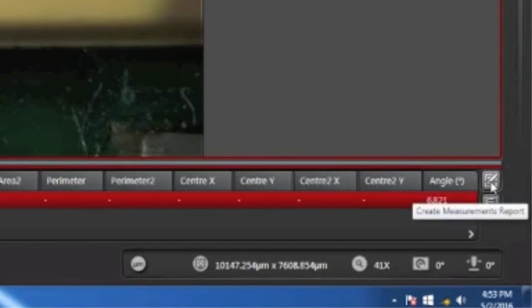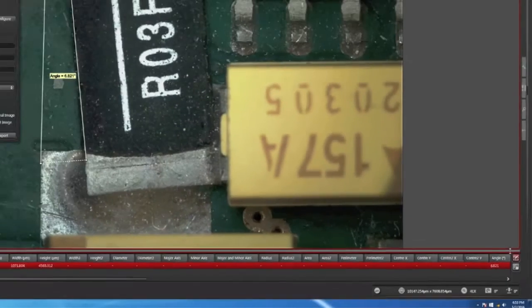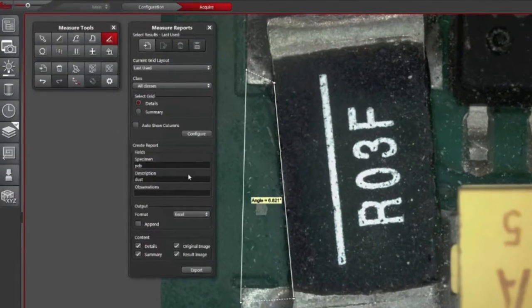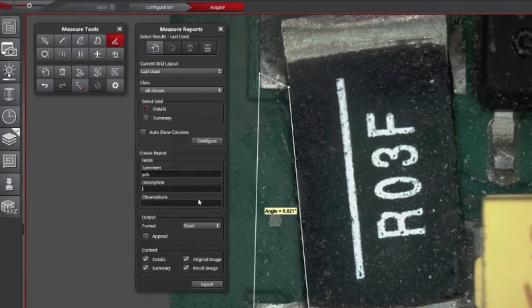If we press that button for measurement export, we get another panel here where we can enter a description, a specimen, and observations, such as the angle.